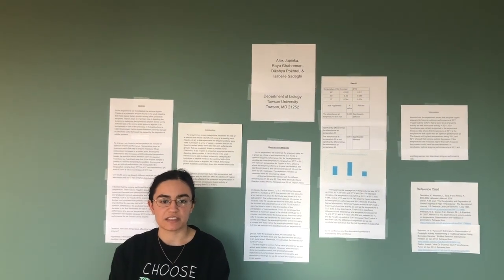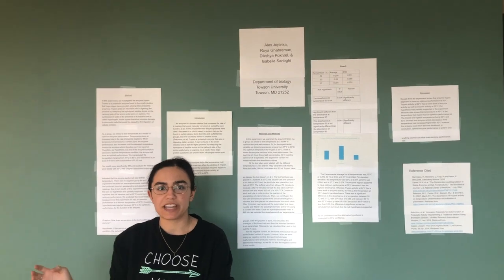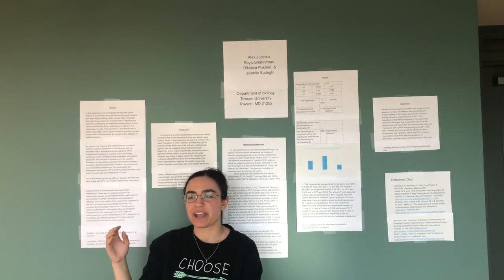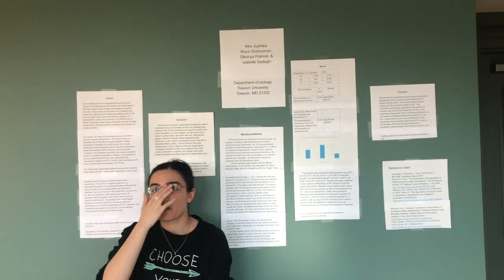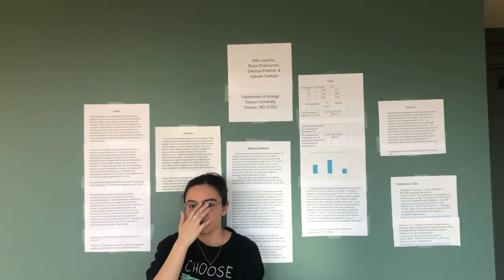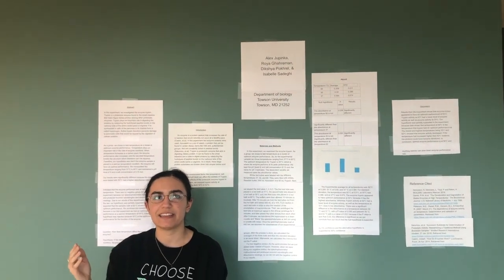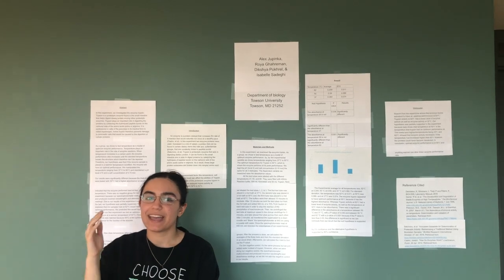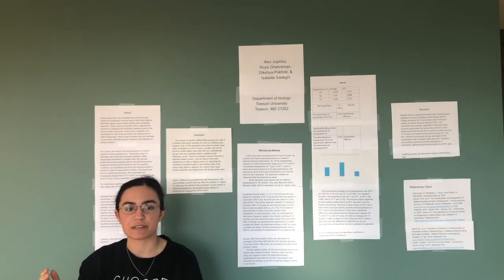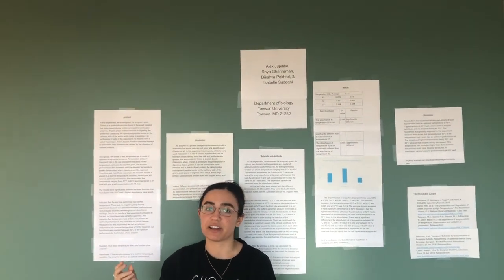And our hypothesis was, if the sample was placed in a warmer temperature condition, the enzyme would have a higher rate of reaction. Our rationale for the hypothesis was that enzymes have an optimum performance at higher temperatures because they increase the activity of an enzyme and the rate of reactions.